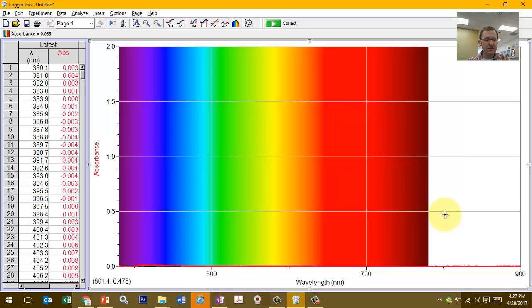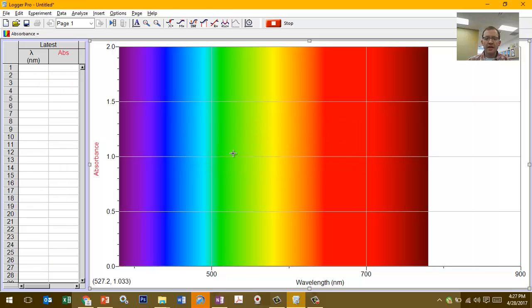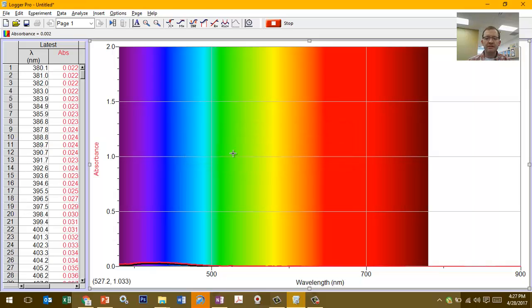So what I'll do first is stick a distilled water sample in there. If I can find my distilled water sample. Here it is. Stick that in there. And distilled water, as you know, is very clear without any colors at all. And so it shouldn't absorb really any wavelengths of color significantly at all. You see here that the only ones being absorbed even a little bit are over here in the blue range. Okay? This particular sample is measuring just a tiny bit of absorption over there, not a whole bunch. So a pretty flat line. A solution without color will basically have a flat line.